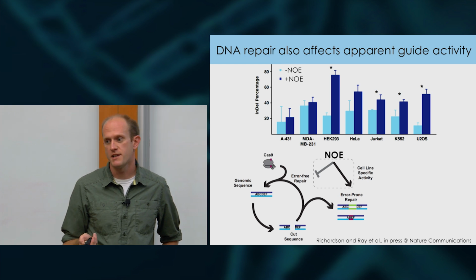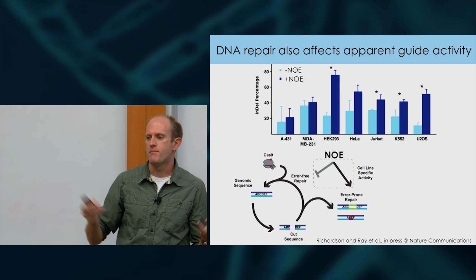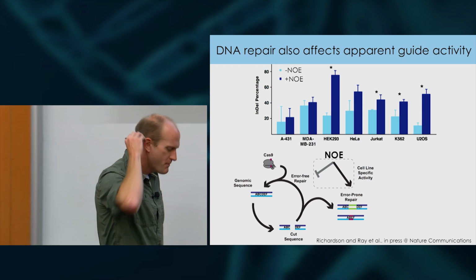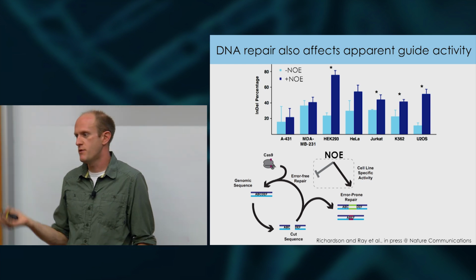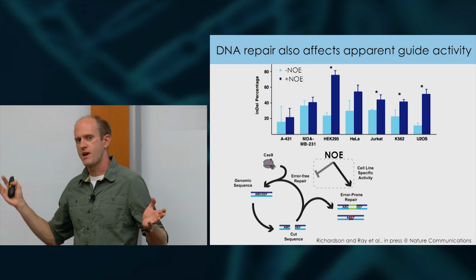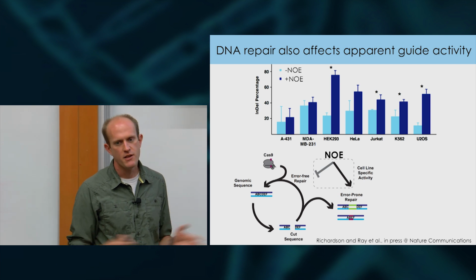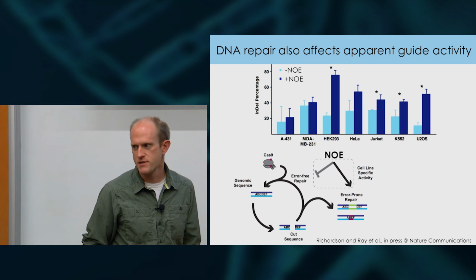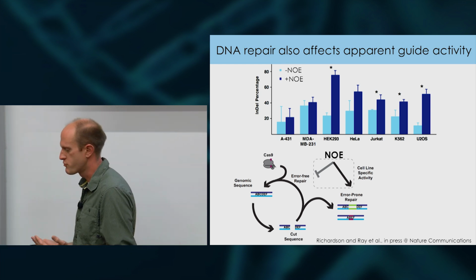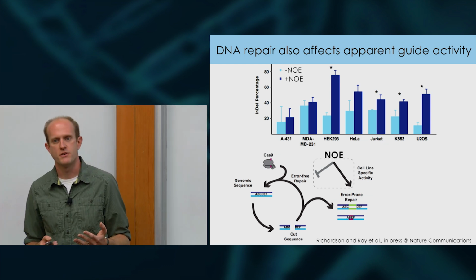So I think there are certainly cases where you would get something that's way down in the weeds, and by guide-seq, it's going to show up. Following up from that, one thing we've been doing in the lab is making custom capture libraries, the same way you would do exome capture. Say you do an unbiased off-target search and get a list of a couple hundred or 1,000 sites from guide-seq or BLESS or any of these methods, and then you make capture libraries. You then deeply sequence those capture libraries and ask how many of those are actually real. From the capture, there are pretty good algorithms based on variant calling to quantify how much of those are actually there.